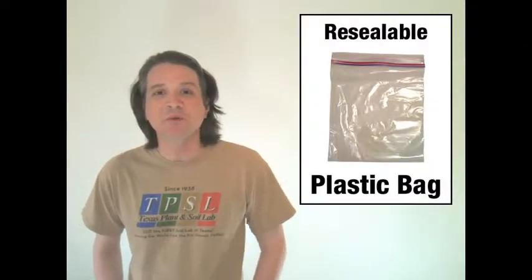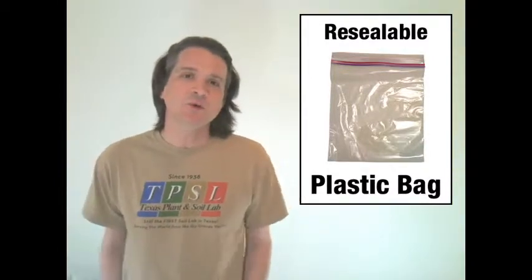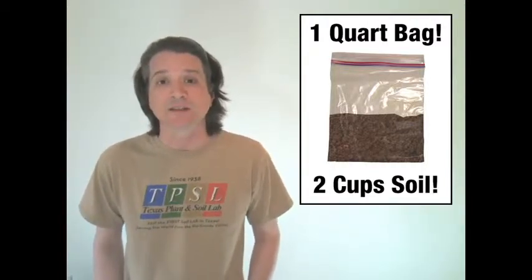When I say resealable plastic bag, they are more popularly known under the brand name of Ziploc or QuickLoc, but any store brand or private label plastic bag will do. You're going to need one quart because you need to fit at least two cups of dried soil sample in it.